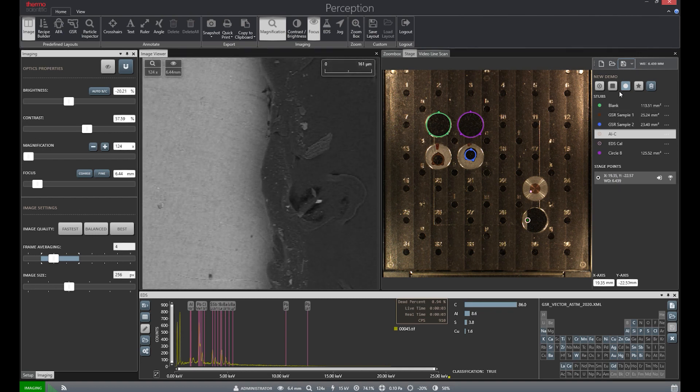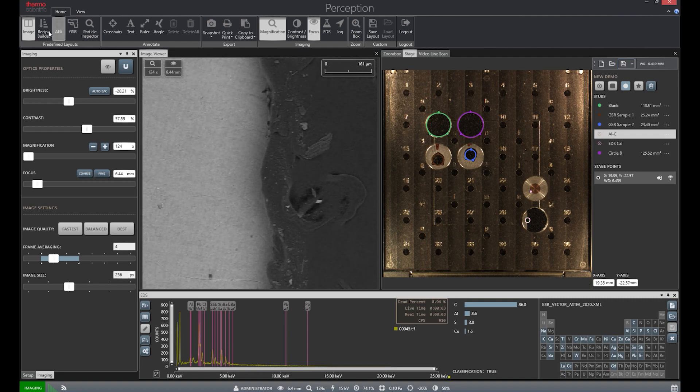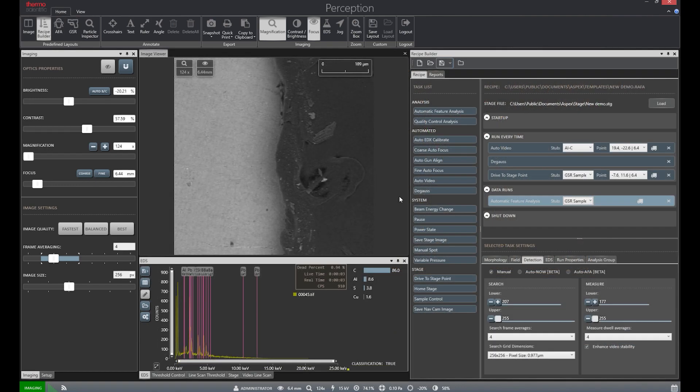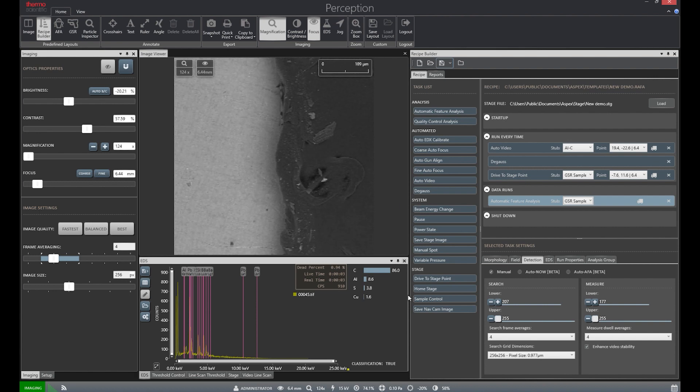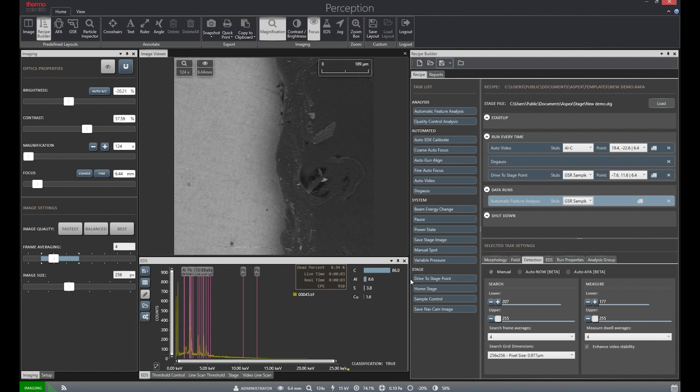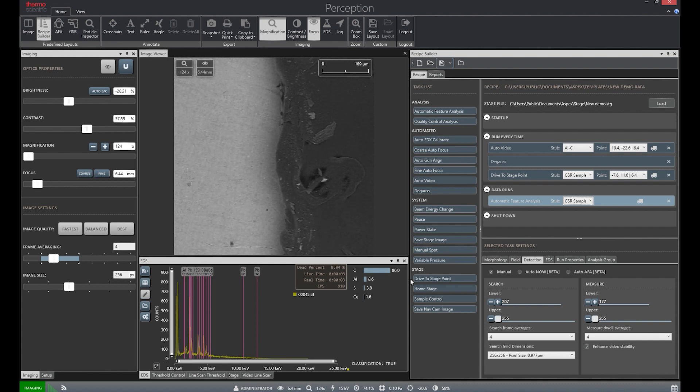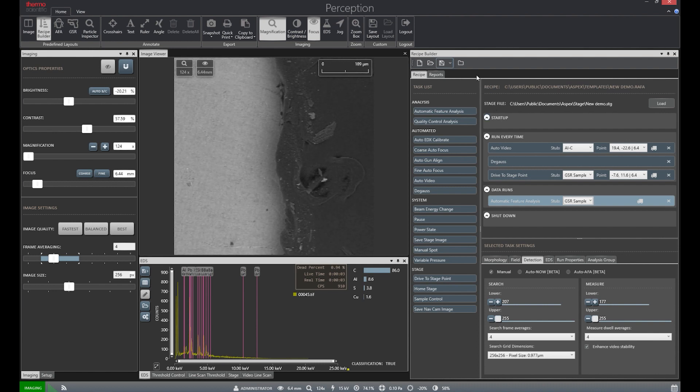We can now save our stage file and switch over to the recipe builder. The recipe builder is used to determine what functions the system will execute during the GSR run. There are many different options to choose from, but a fantastic feature about perception is that recipes can be saved and reused, so there is no need to create from scratch at the beginning of each run.